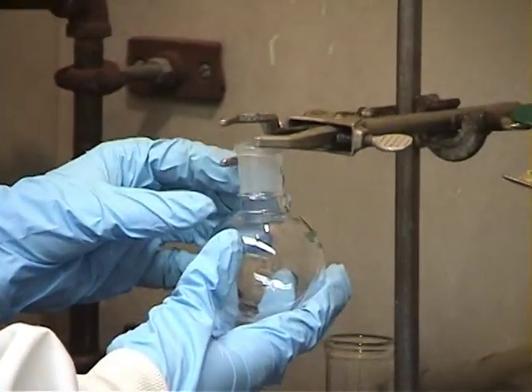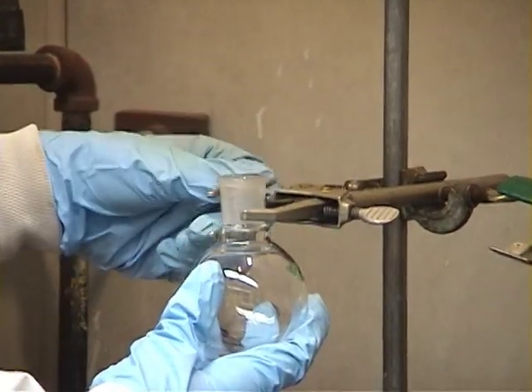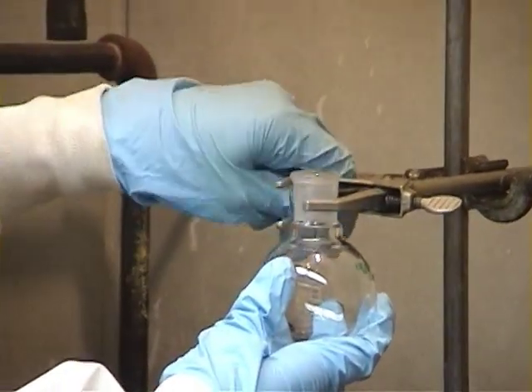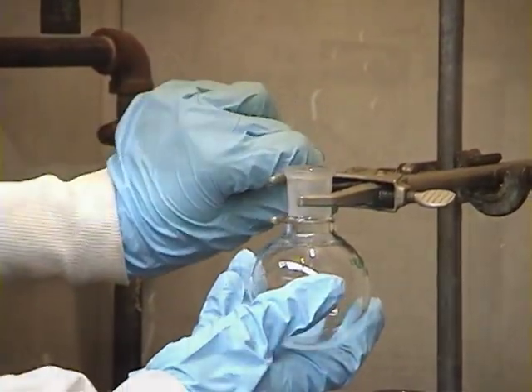a round bottom flask is clamped to one ring stand. The flask must be large enough that the solution does not take up more than half the flask.